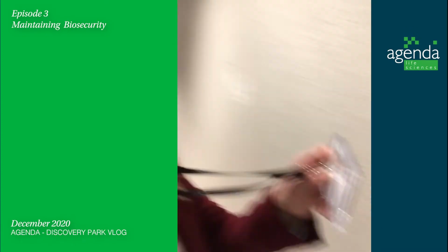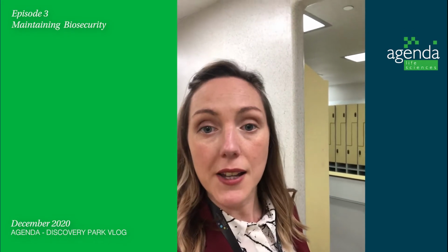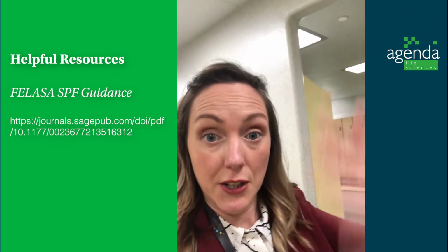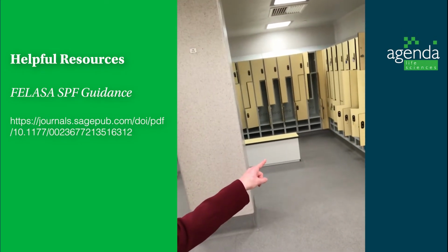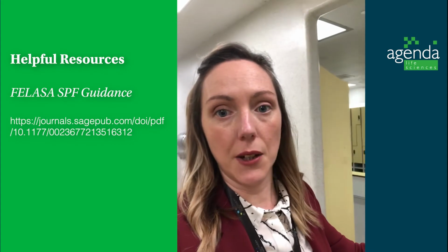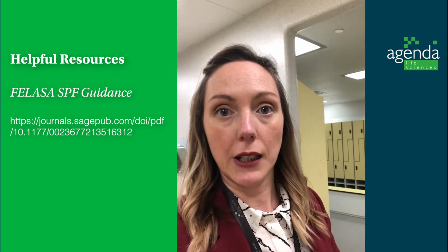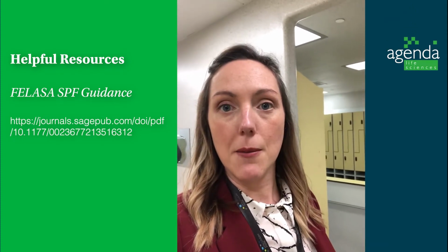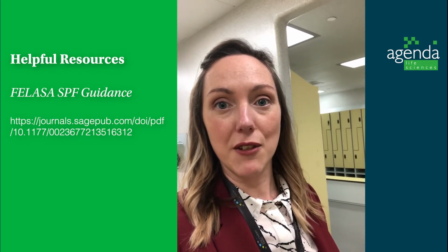So first, we've got security working. We're going to maintain the facility at SPF, which means specific pathogen free. That means this barrier denotes a relatively dirty side, where I am now, and a far, far cleaner side on the other. What you'd commonly do when you first arrive at work is remove your outer clothing, step over the barrier, put on surgical scrubs, and I think a common misconception is that those surgical scrubs are there to keep you clean. It's actually the reverse.